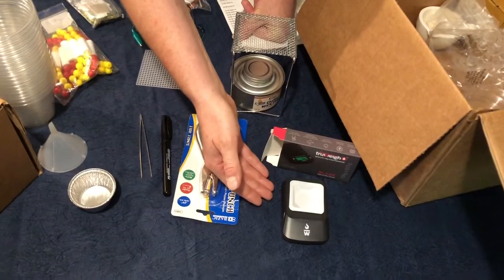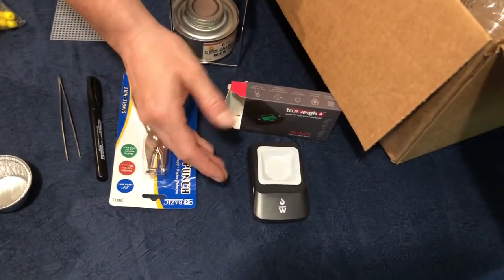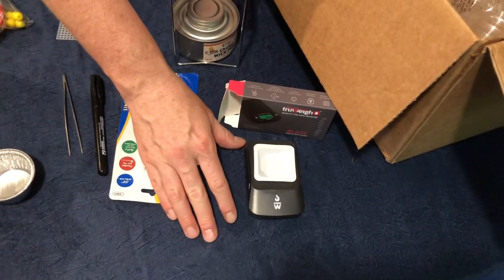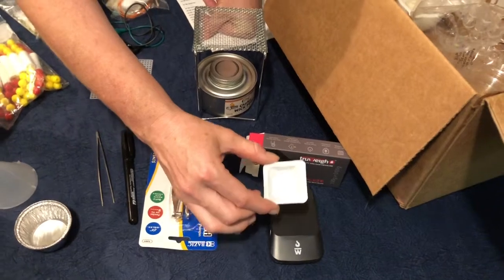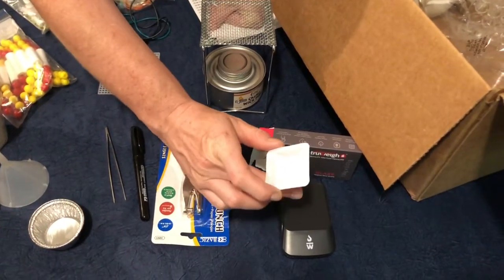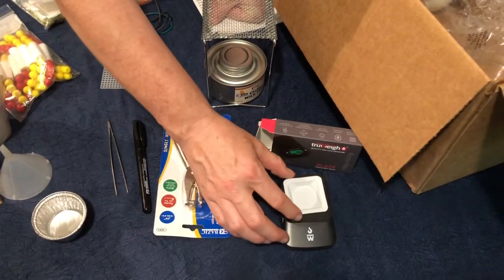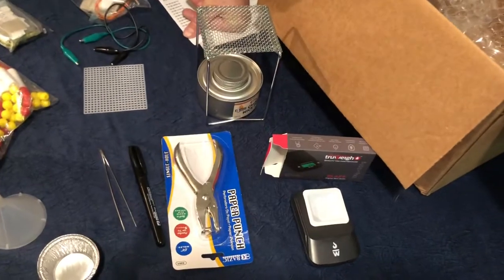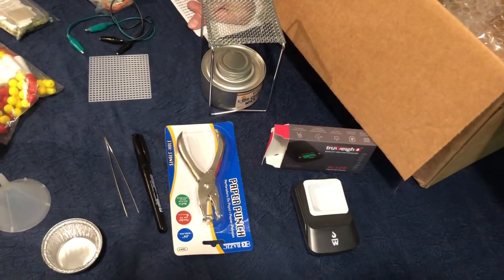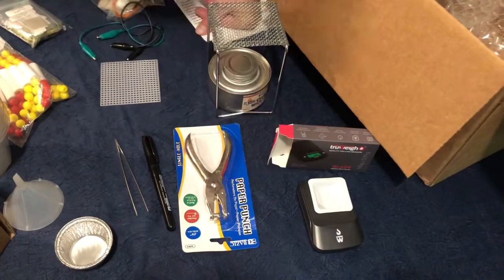This is the most adorable little scale. What comes along with the scale is a little weigh boat. Please do not ever put anything directly on the scale — we always put items in a weigh boat and then tare or zero out the scale to subtract the weight of the weigh boat before we weigh our substance. Then we place the substance we want to weigh inside the weigh boat.